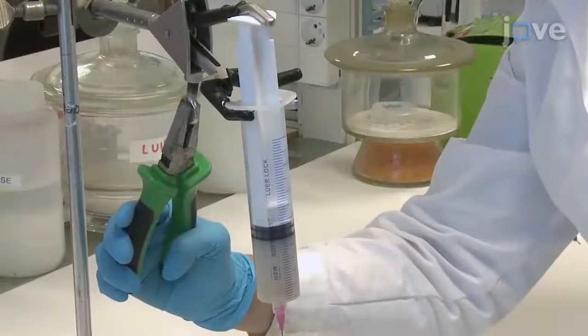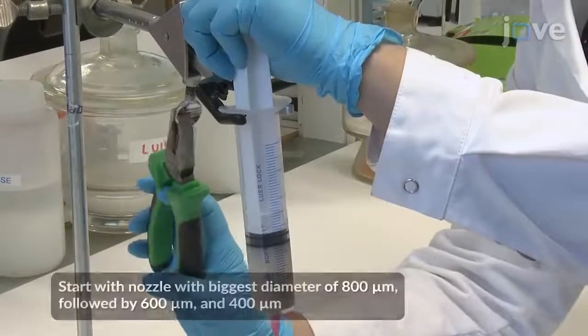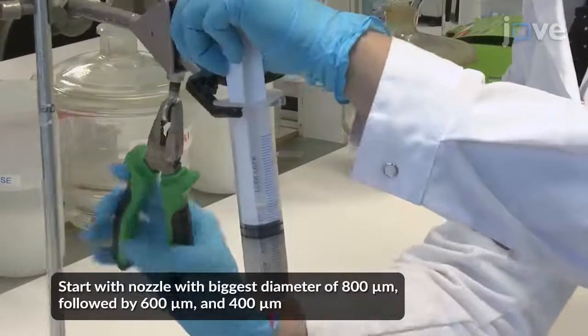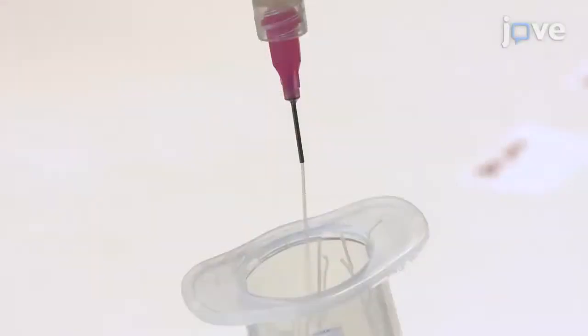Next, with the help of a mechanical clamp, pass the mixture through a series of nozzles with different diameters into another 60 mL syringe. Repeat the process until smoothly extruded filaments of hydrogel ink are obtained.